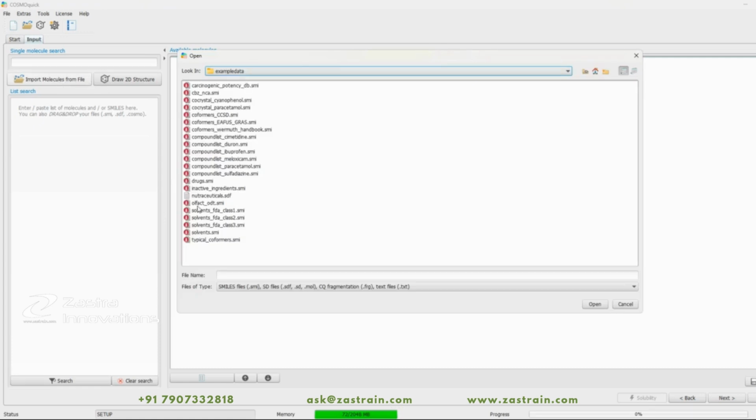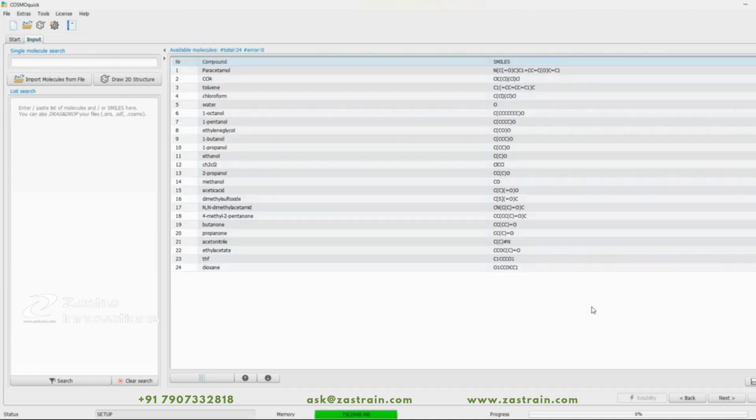If I come up here, I have a list of SMILES, or a list of molecules, which has been provided. So let's go for paracetamol, and in this particular video we are going to go for the co-crystal and solvate screening. So let's open this one. This is the first step.